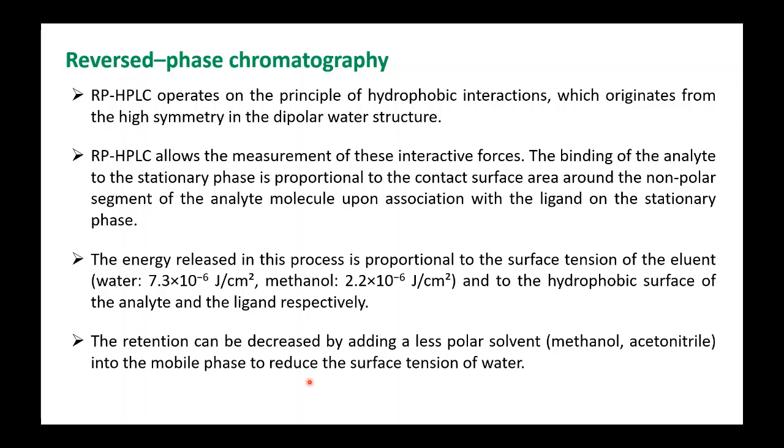become less. Okay, ultimately you are moving from high polar to less polar, and if you have more hydrophobic character, less polarity, you have more interaction. So if you have more hydrophobic character, your retention time will be more in case of less polar compound. Okay, but for more polar compound, your retention time will be less. Okay, so this is the overall message.